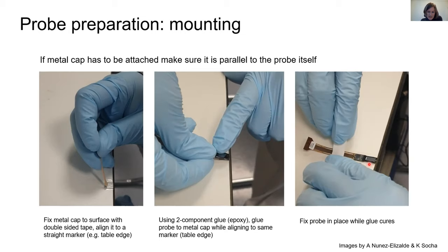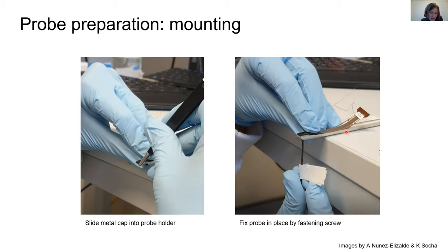Once it's fixed in place, you just fix the probe really securely, for example with tape so the glue can harden. Once the metal cap is on, you can then mount the probe to the rod. This is shown here. You just slide the probe into the rod using forceps like so and then fix the probe with the screw that goes through the rod and onto the probe. You can fasten it. Now we have the probe mounted onto the rod.